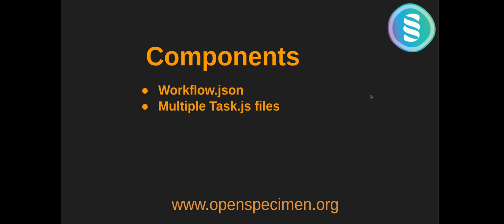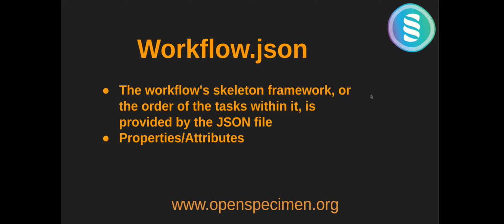The two major components of the workflow are the workflow.json file and multiple JavaScript files. The JSON file acts as a skeleton framework for the workflow. In this file, we'll define the order of the tasks that we need to see in our workflow. It has multiple properties and attributes, which we will go through in detail.